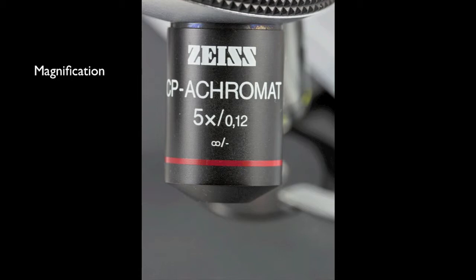Magnification with this lens is 5x, as you can see on the barrel. The ocular lens magnifies the image 10 times for a total magnification of 50x, or 50 times. This means that objects will appear 50 times larger than they actually are.